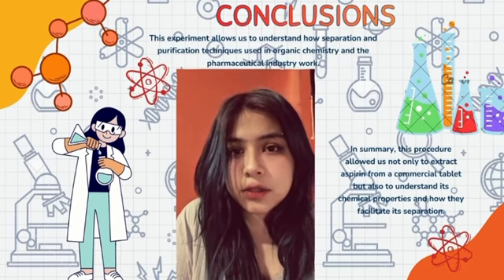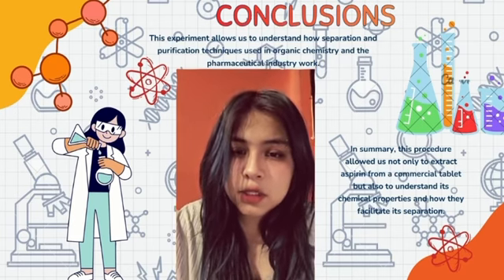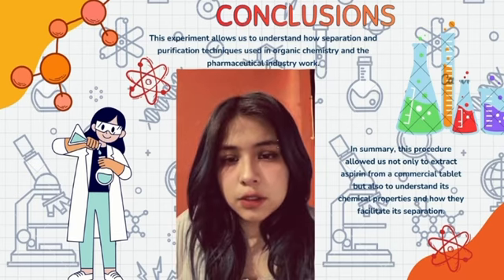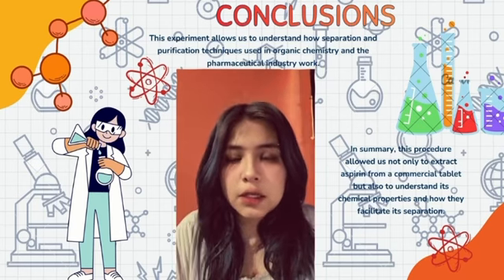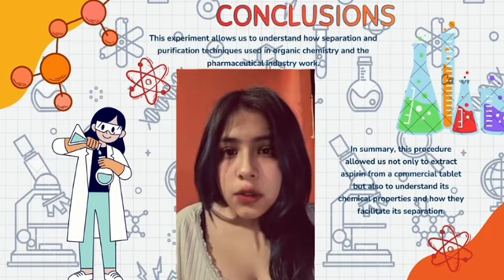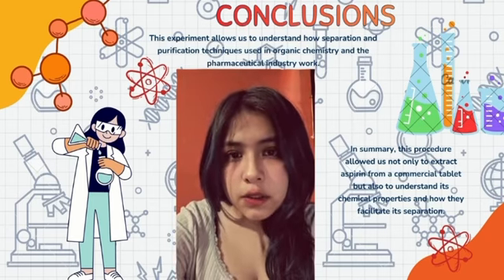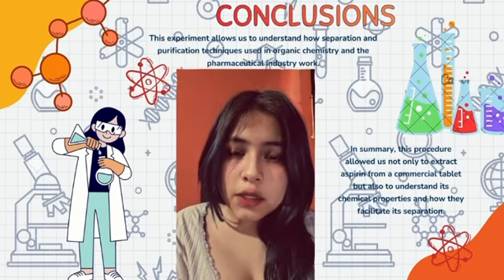In summary, this procedure allows us not only to extract the active ingredient from a commercial tablet, but also to understand its chemical properties and how the separation works. In conclusion, we chose this experiment because it seemed to us the best use of tools and practice from class.